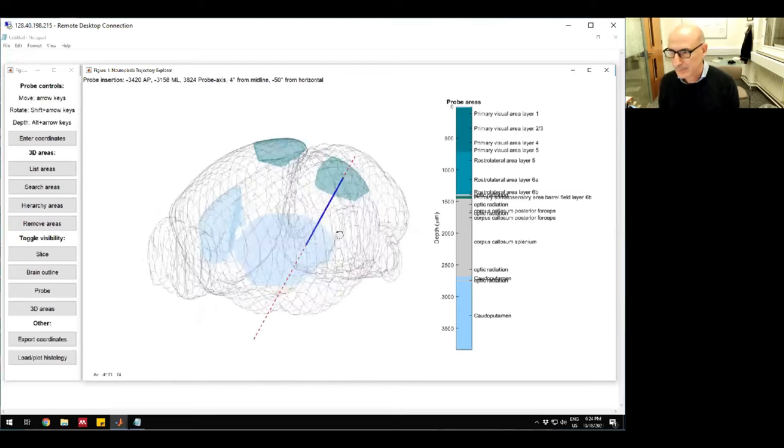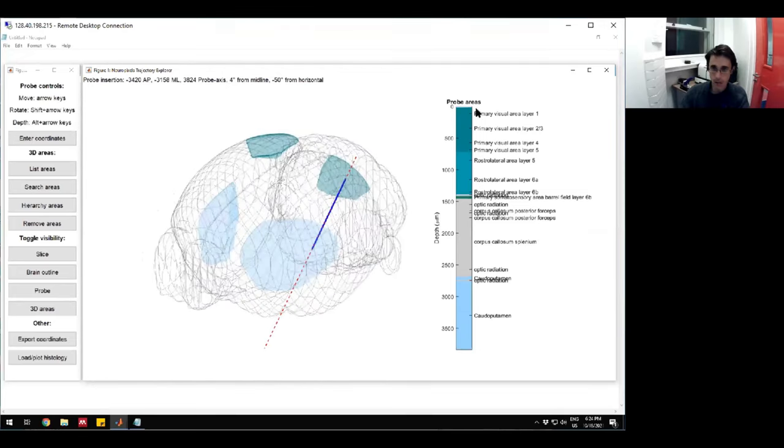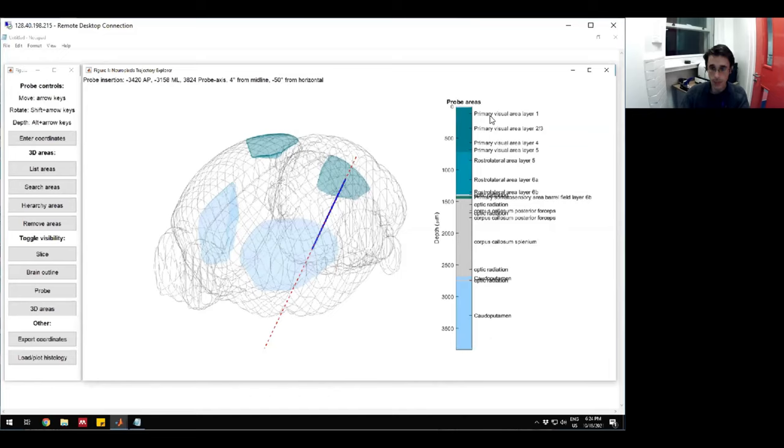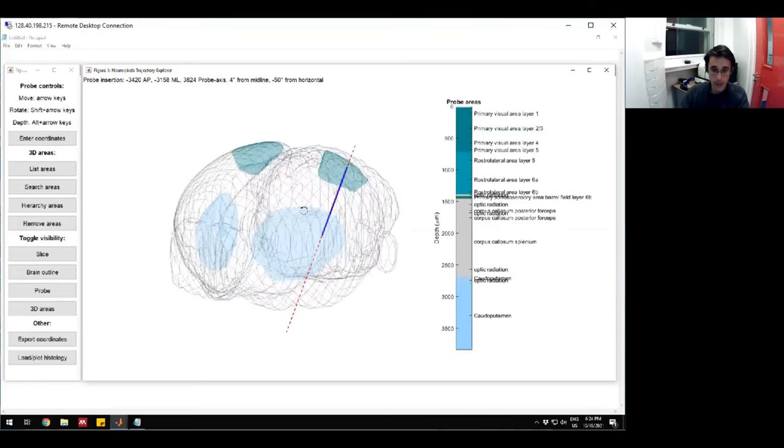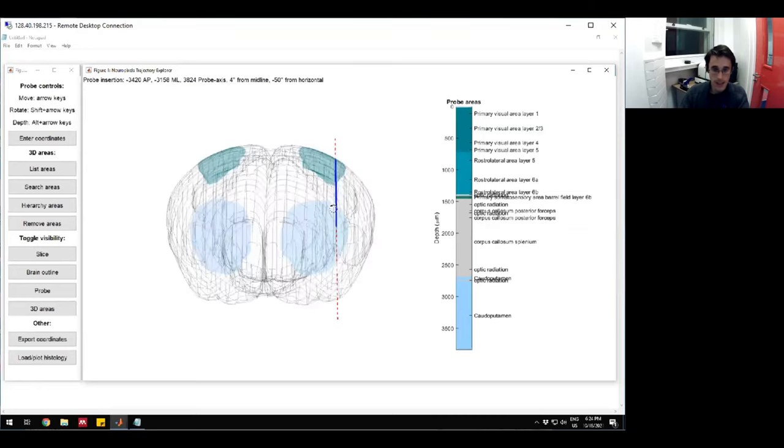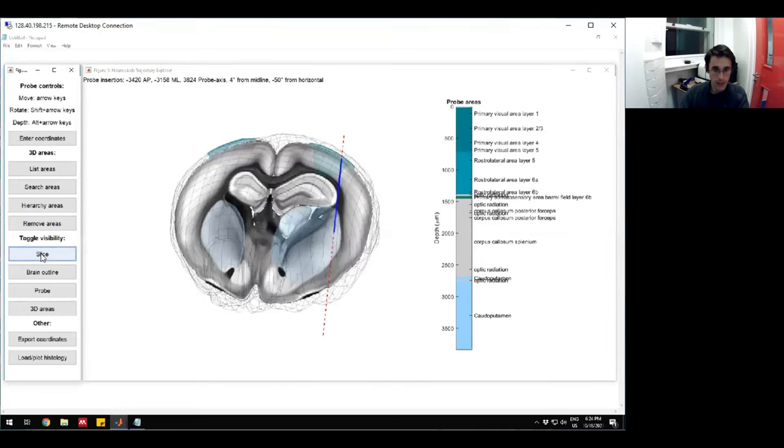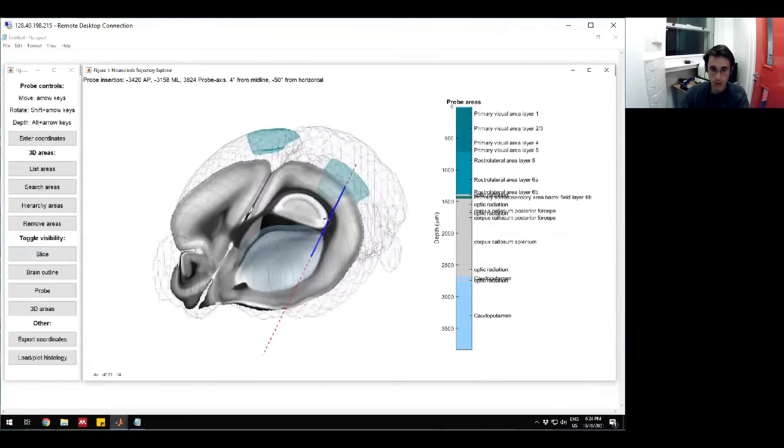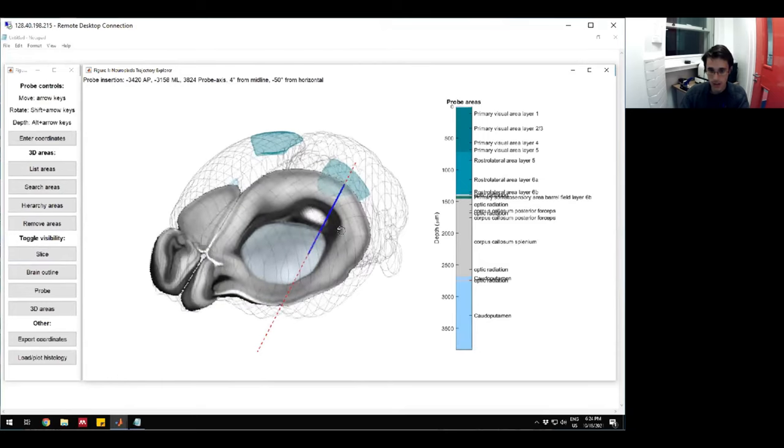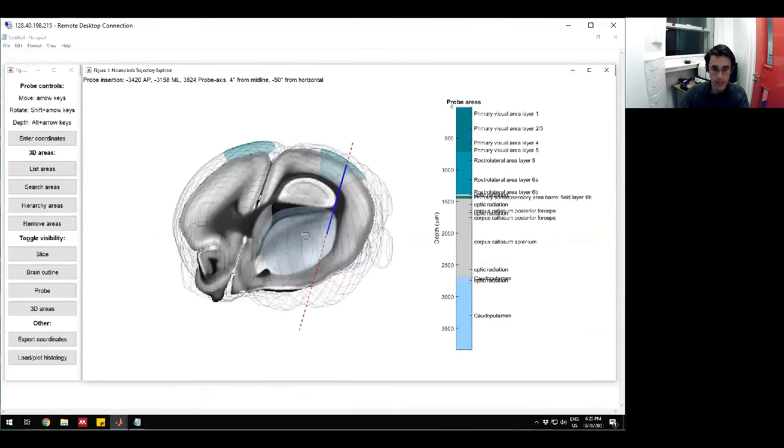It looks like it's intersecting with those areas. Now on the right, you've got this readout of where the probe is going through. On the top, it's going through the primary visual cortex. Then it goes through this RL area and then a bunch of white matter. And then it goes through the striatum. So it looks like we hit all those things. Now, if we turn the slice back on, we can get a feel for where our probe is going to go in the rest of these places that we're not targeting.